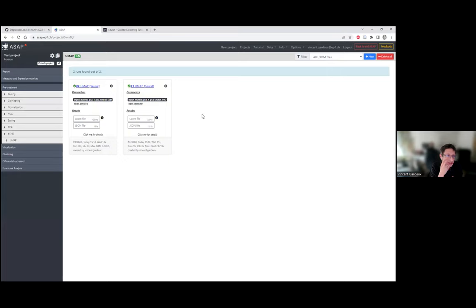The main limitation is if you work with really big data sets. If you work with the traditional 10x data sets, which contain from, I don't know, 4,000 to 10,000 cells, then it's okay to work with 30, 50, even 10 PCs. It's fine. It works, generates pretty similar results.